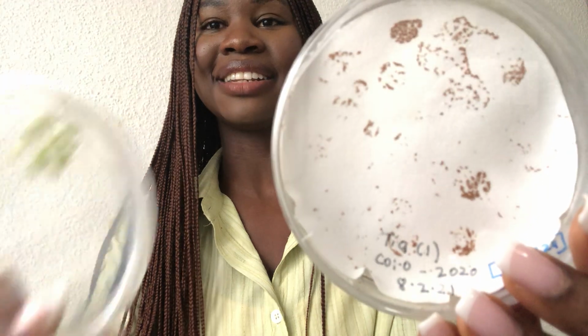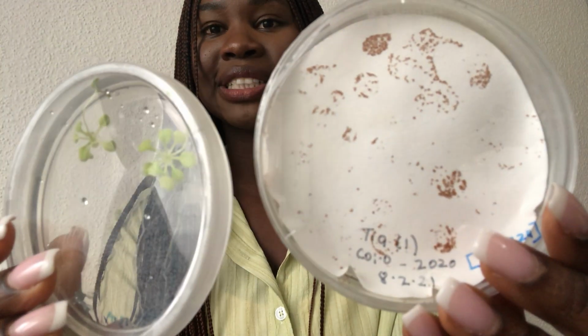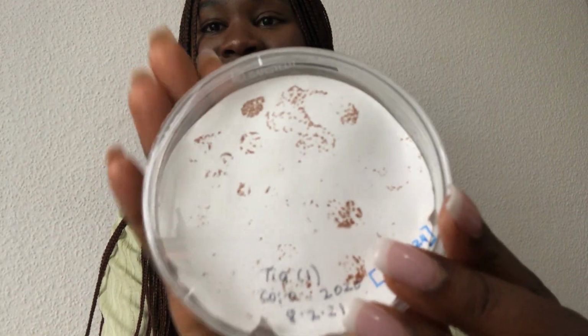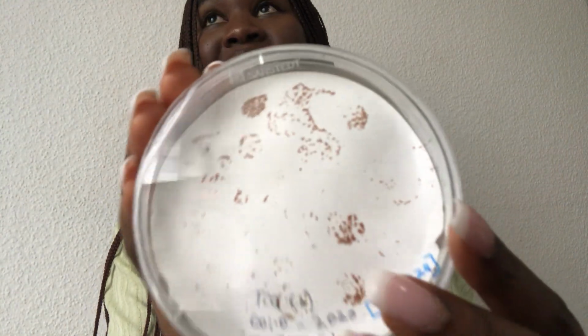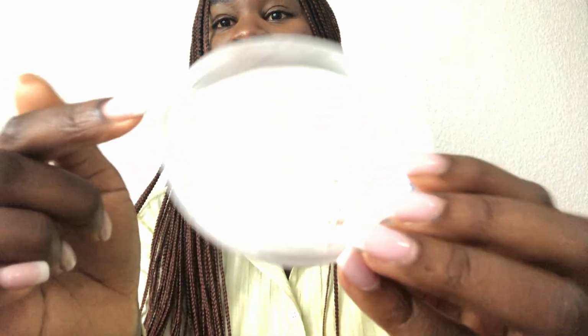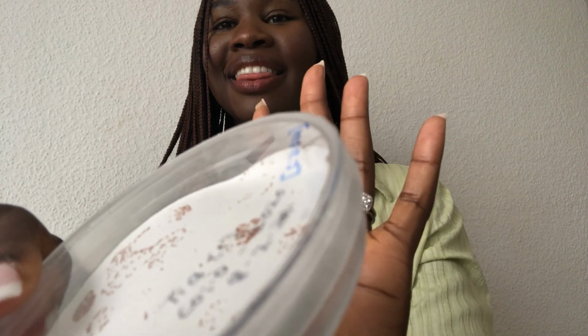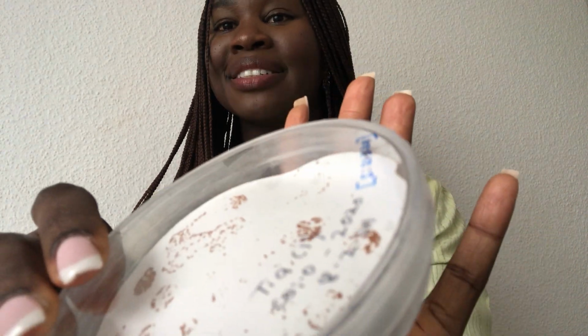So as you may already have seen, both the seeds and the sample plant are quite sterile. I can tell you certainly that this is a very sterile sample. The petri dish inside was autoclaved. The seeds were sterilized, and the petri dish was sterile, and the work was done under a clean bench, right?